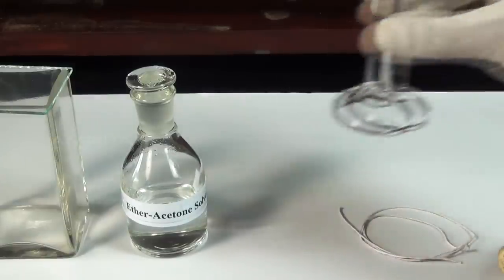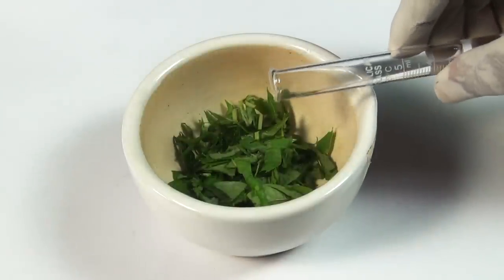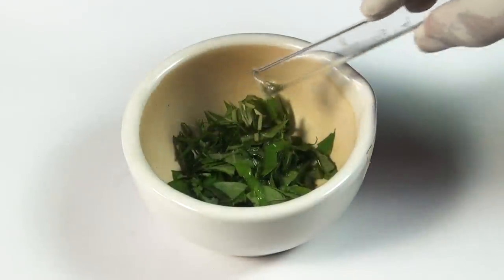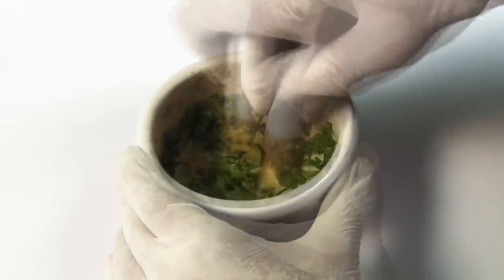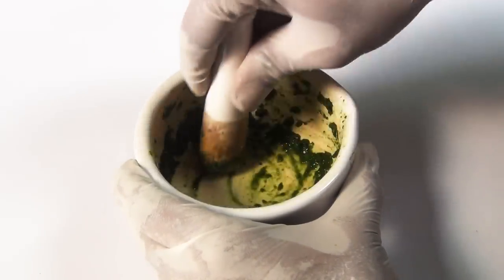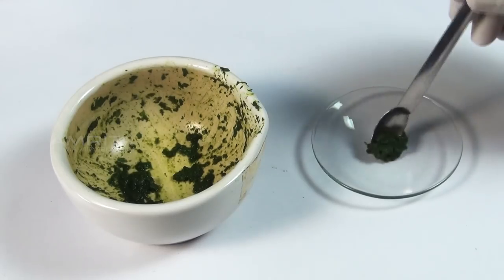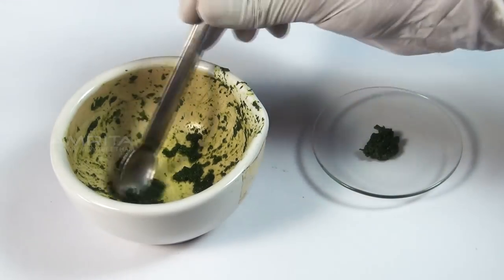Take a measuring cylinder that contains 5ml of acetone and pour it into the mortar. Grind the spinach leaves using the mortar and pestle. Place the extract into a watch glass using a spatula.